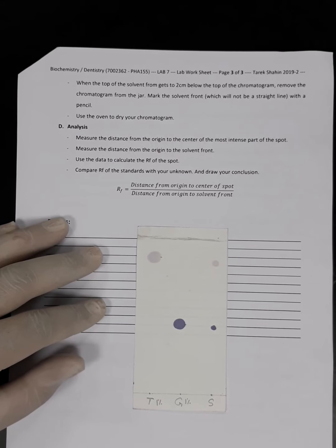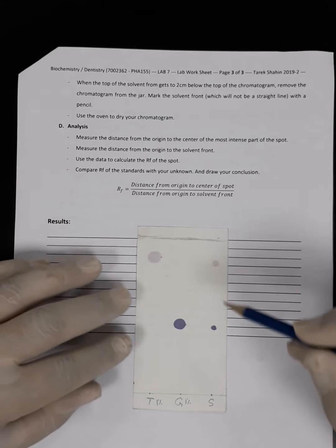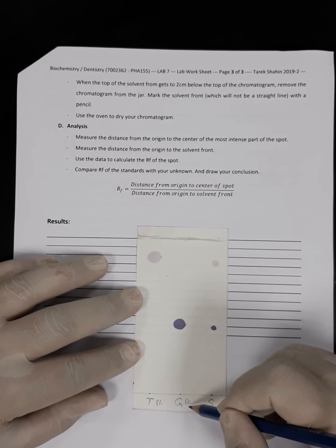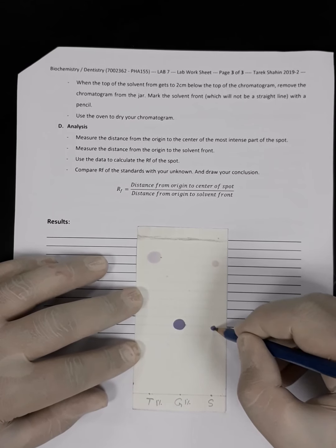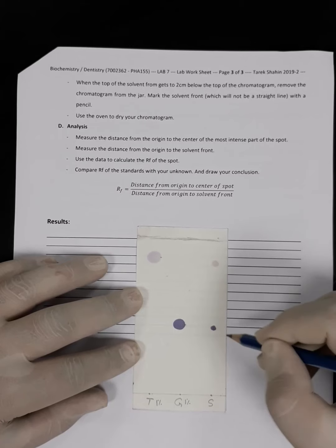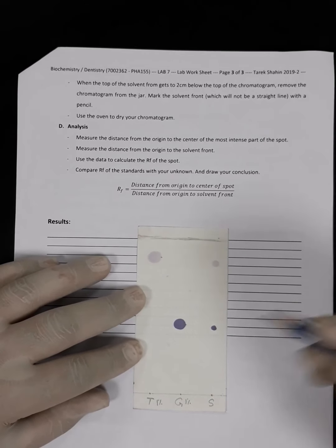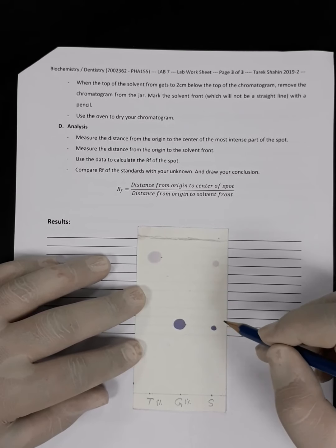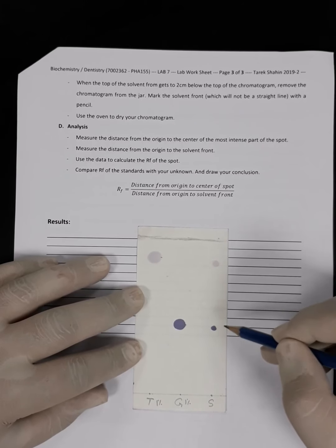Now we are going to the quantitative analysis of the chromatogram. One more thing you have to note is that this circle here represents the concentration of 1%, while this circle here represents again the glycine, but with unknown concentration. Okay, so can we use the chromatogram in quantitative analysis? Yes, we can. How are we going to do that?